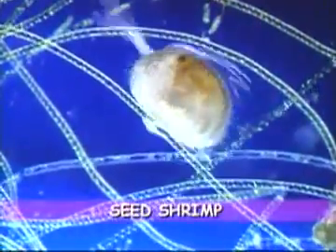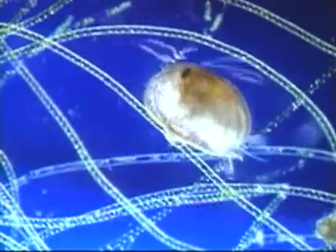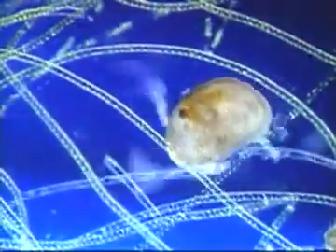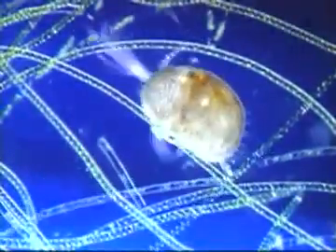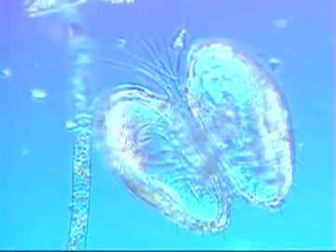Seed shrimp are unusual because they are nearly entirely enclosed in a shell. Only their antennae and legs are exposed. They're not really shrimp, but they are related. The dark spot you see near the top of this one's shell is its eye. When a seed shrimp dies and its shell opens, it sometimes resembles a delicate butterfly.